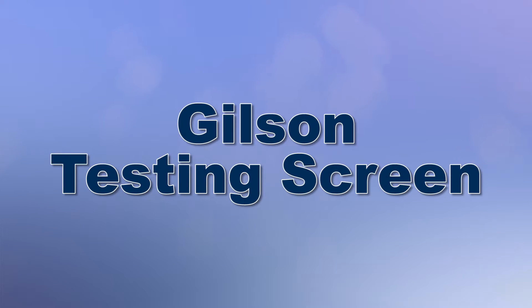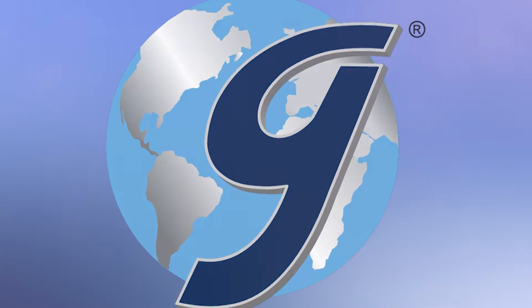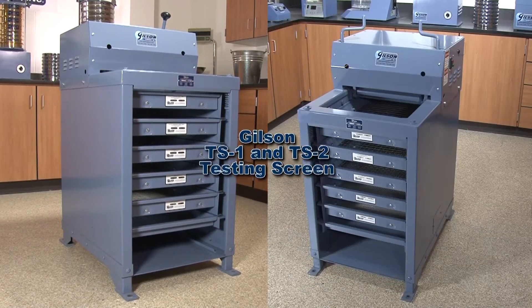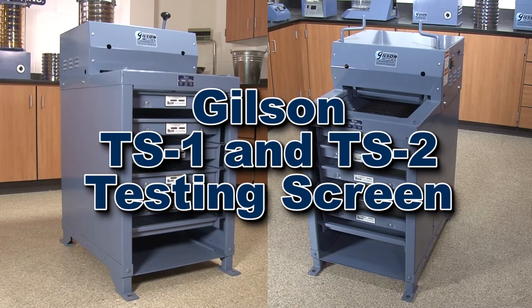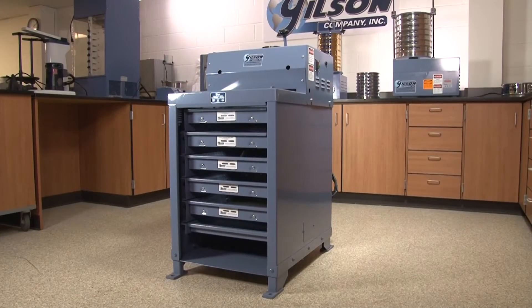The Gilson testing screen has been the gold standard for particle sizing of large samples for over 75 years. The robust and high-capacity Gilson TS1 and TS2 testing screens are designed for busy high-production settings and will quickly process up to a cubic foot of material into six size fractions in as little as five minutes.